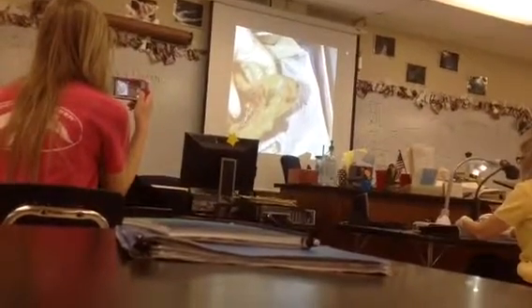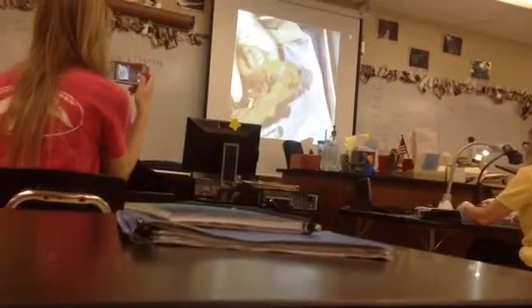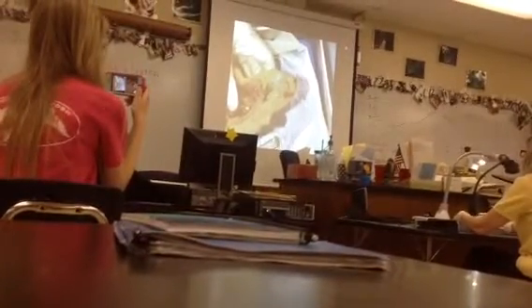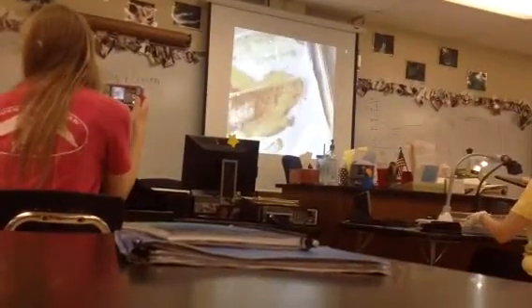Then up here above the heart, all of this material that sits up on top of the heart, that's the thymus. Don't forget you have to know your systems also. So I may have blue pin structure and it's thymus, and then I may say blue pin system, and remember that's lymphatic. So you've got to know your systems. Okay, so that's that rat.